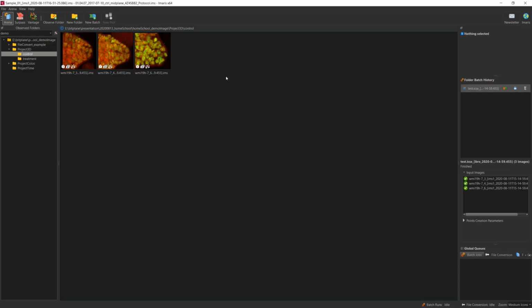And you know, you were in the past a bench scientist as well, so you can probably speak from experience and outside of being on the Imaris team too. But yeah, could you talk a little bit about that for us?